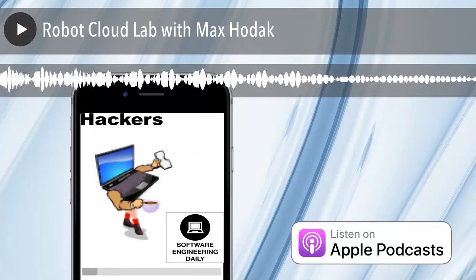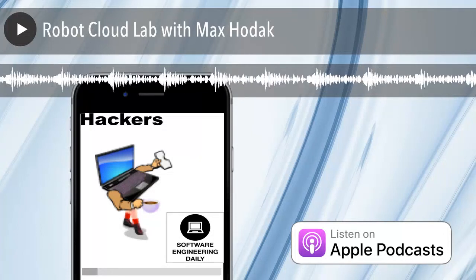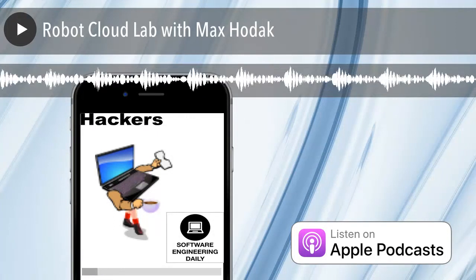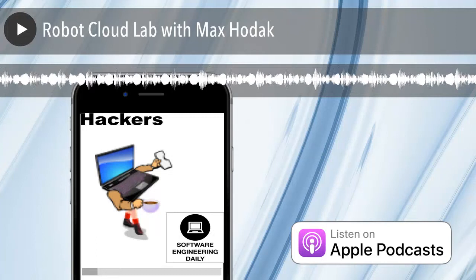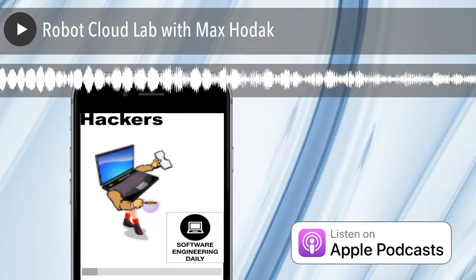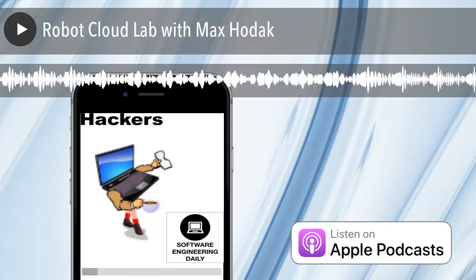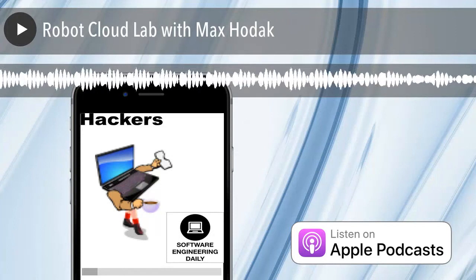And in that, there's a lot of instruments we don't have. We don't have NMR. We don't have mass spec yet. So there's a lot of instruments to bring in and a lot of capabilities to add. Bringing in a new instrument depends, right? To take the mass spec case, it's a couple months and hundreds of thousands of dollars typically.